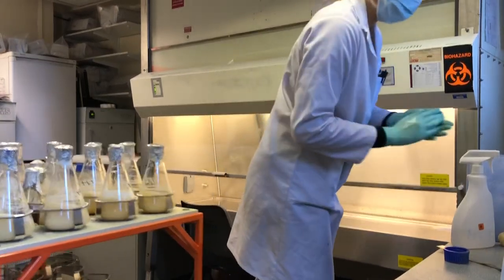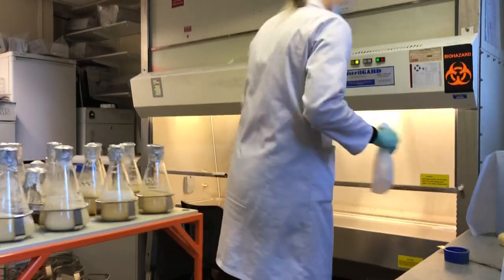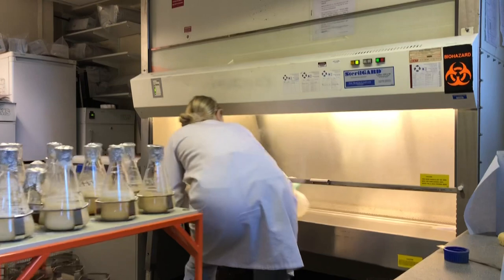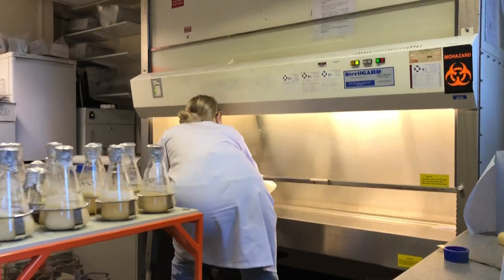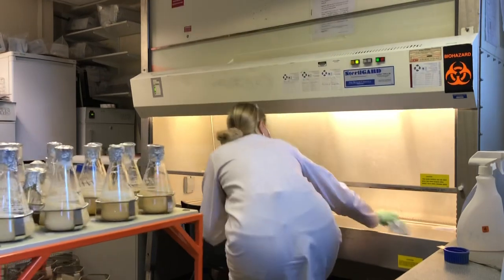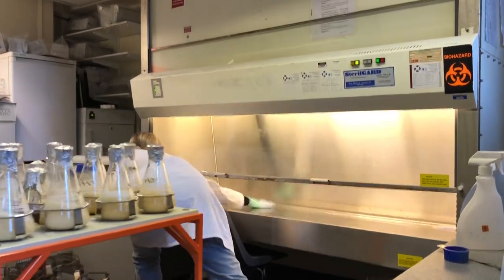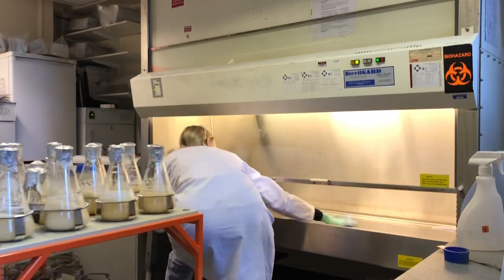Here I am just washing my gloves with 70% ethanol. It's equally important to wipe down the clean bench with the 70% ethanol just to make sure you decontaminate all of the surfaces. So it's just a case of spraying the 70% ethanol, taking some blue paper towel and wiping it all down until it's lovely and clean.